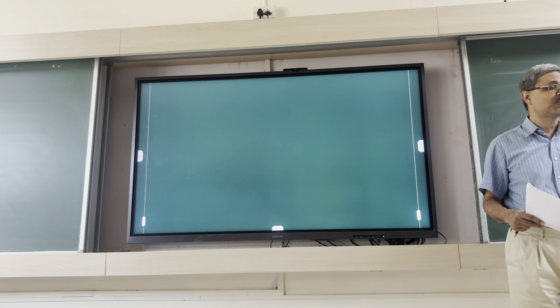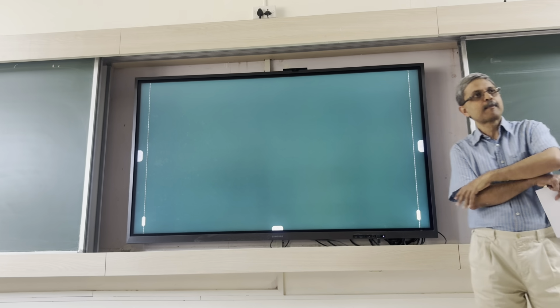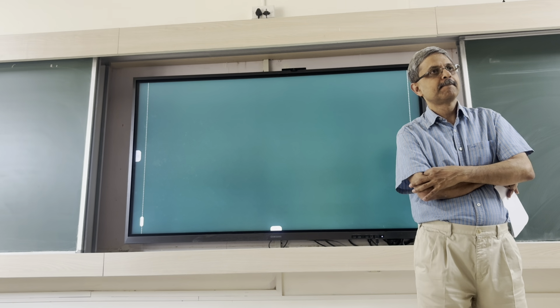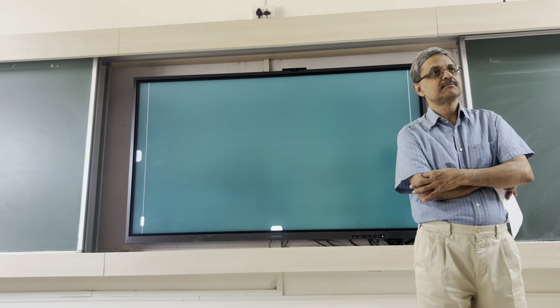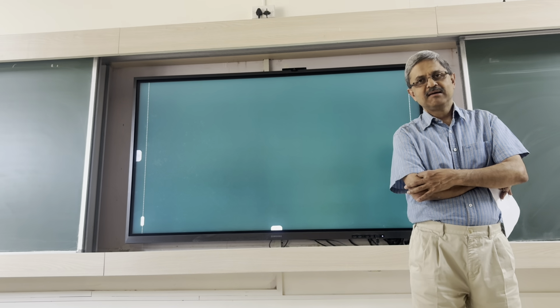At 100 Tesla, what would happen? I don't know. I don't think it's big enough. It is in some kind of theoretical limit to that extent. We don't want to go up to high fields. Theoretical limit for what? For persistent magnets and magnetic... For electromagnets, we cannot go beyond like 4-5 Teslas.